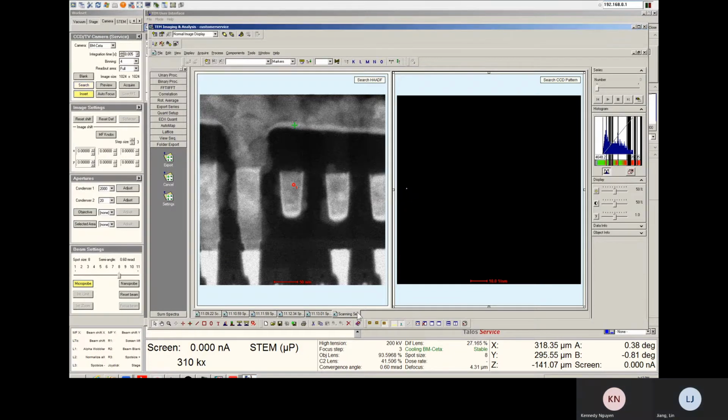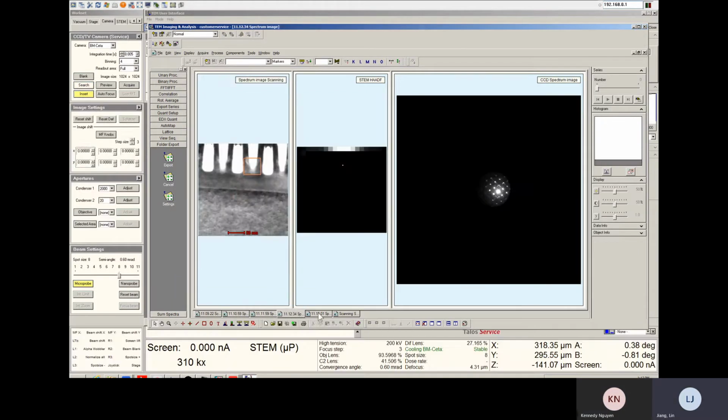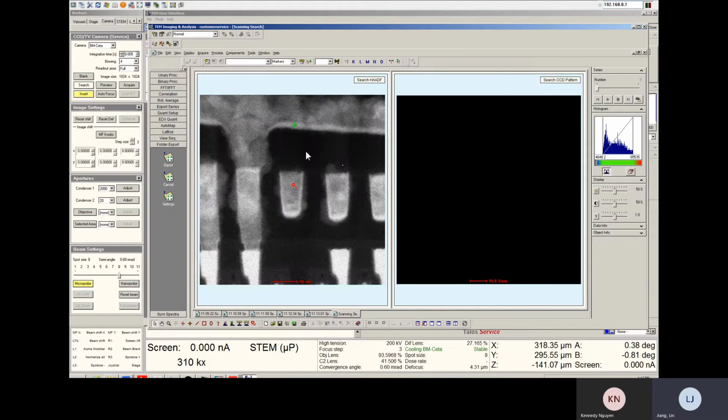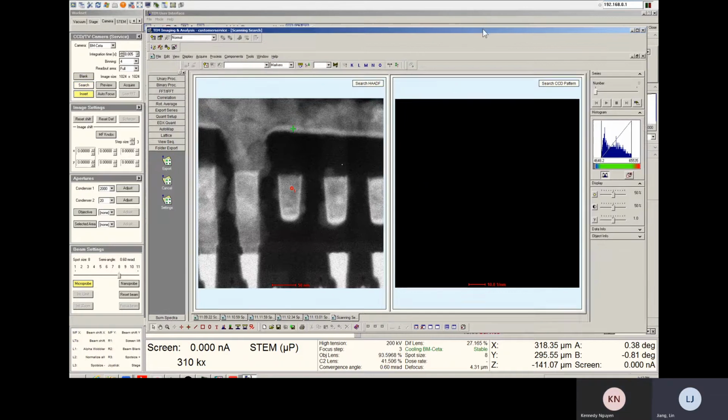Let me see. Something goes. Should be good. There is an error on this one. Let me restart this one.